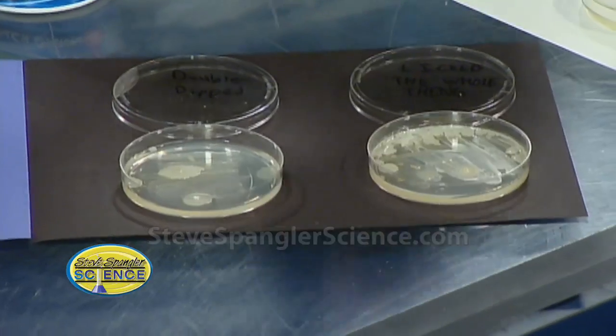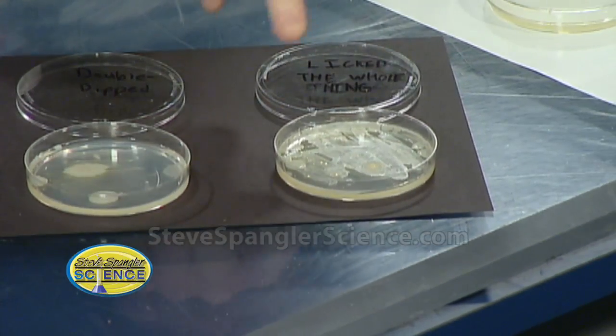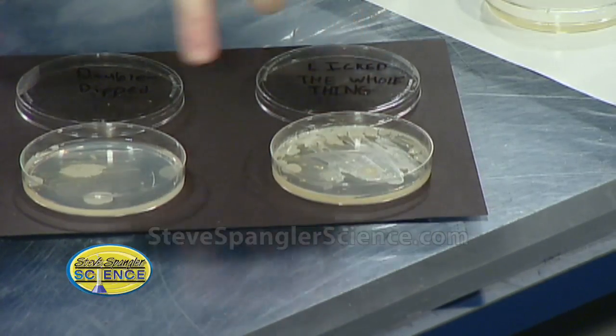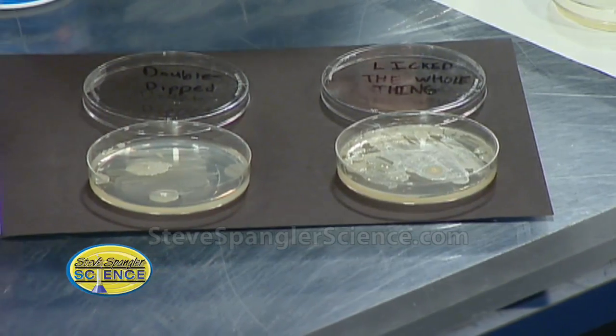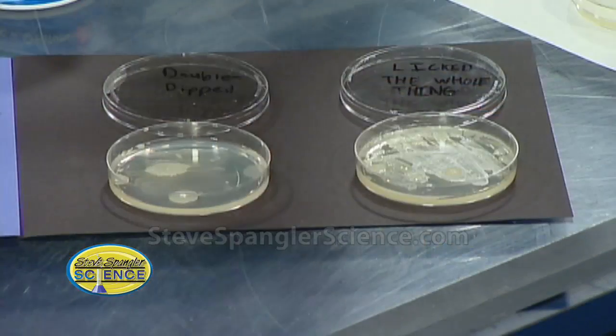This one is called 'I lick the whole thing' — and this is disgusting. People say 'ah it's no big deal' — look at this! Look at the colonies that are growing there — a huge number of colonies. So no double dipping. If you have to, just go back and look at the petri dish and you'll realize — that's petri pudding.